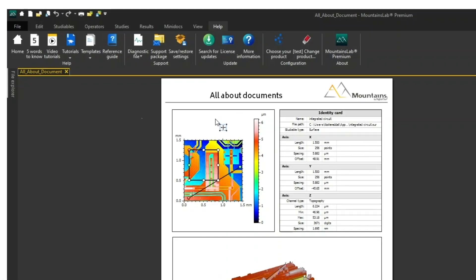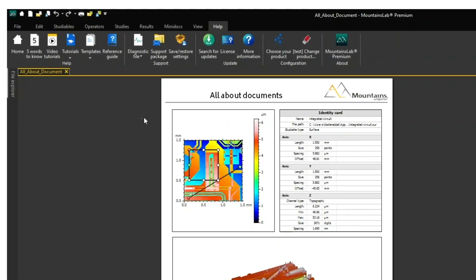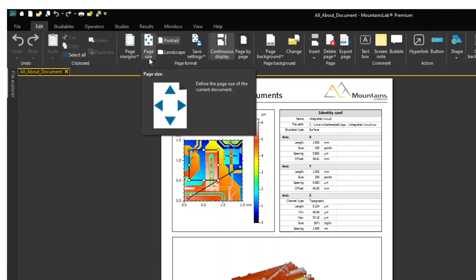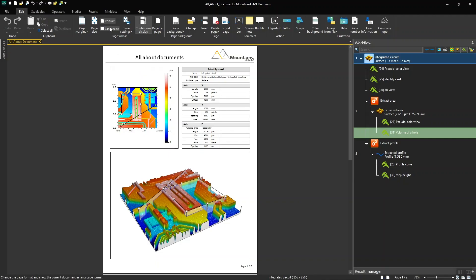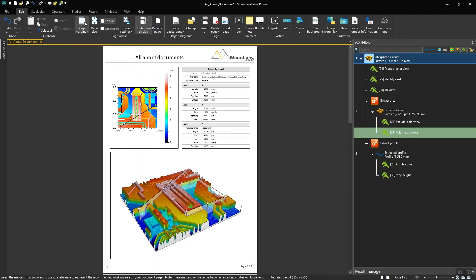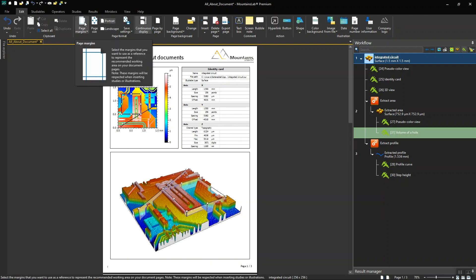Options for customizing the document can be found in the Edit tab at the top of the interface. In the Page Format section, you can choose Page Size, select Portrait or Landscape Format, and set Page Margins.